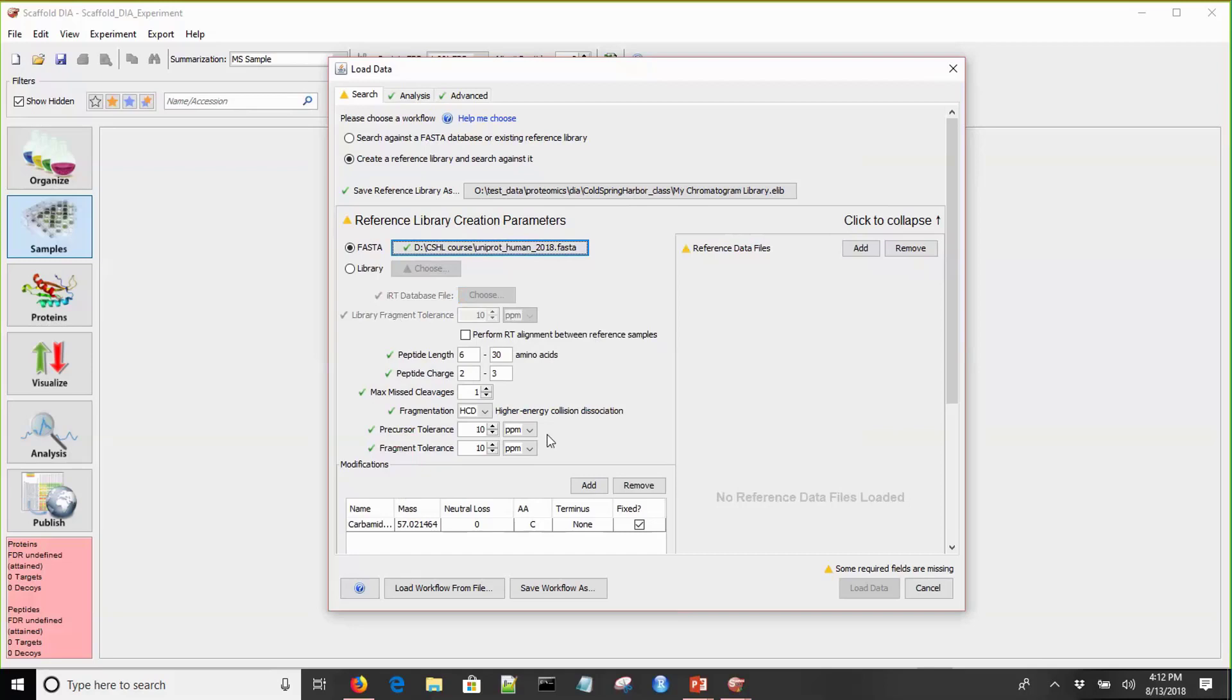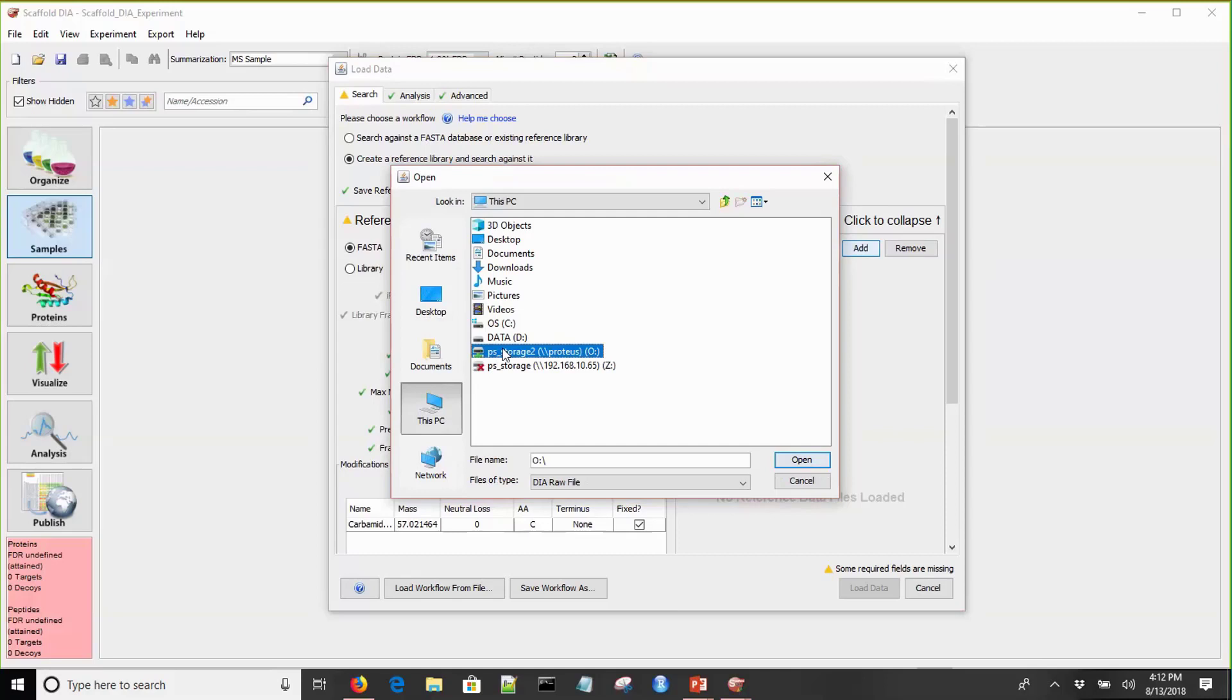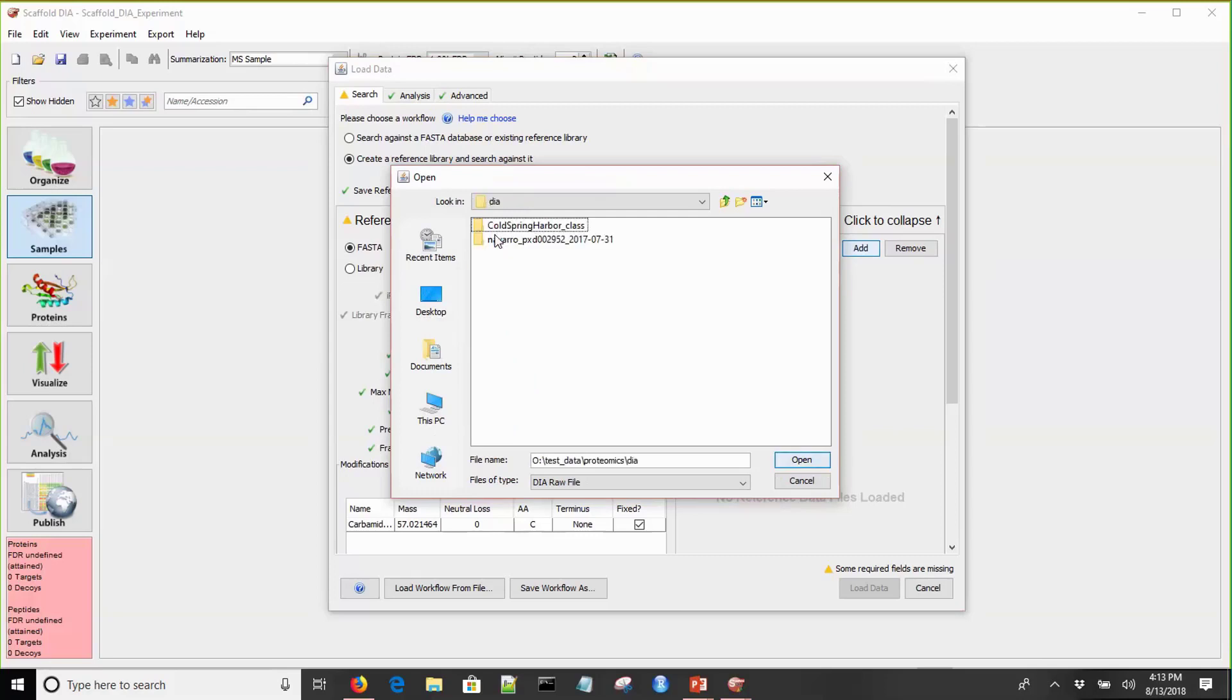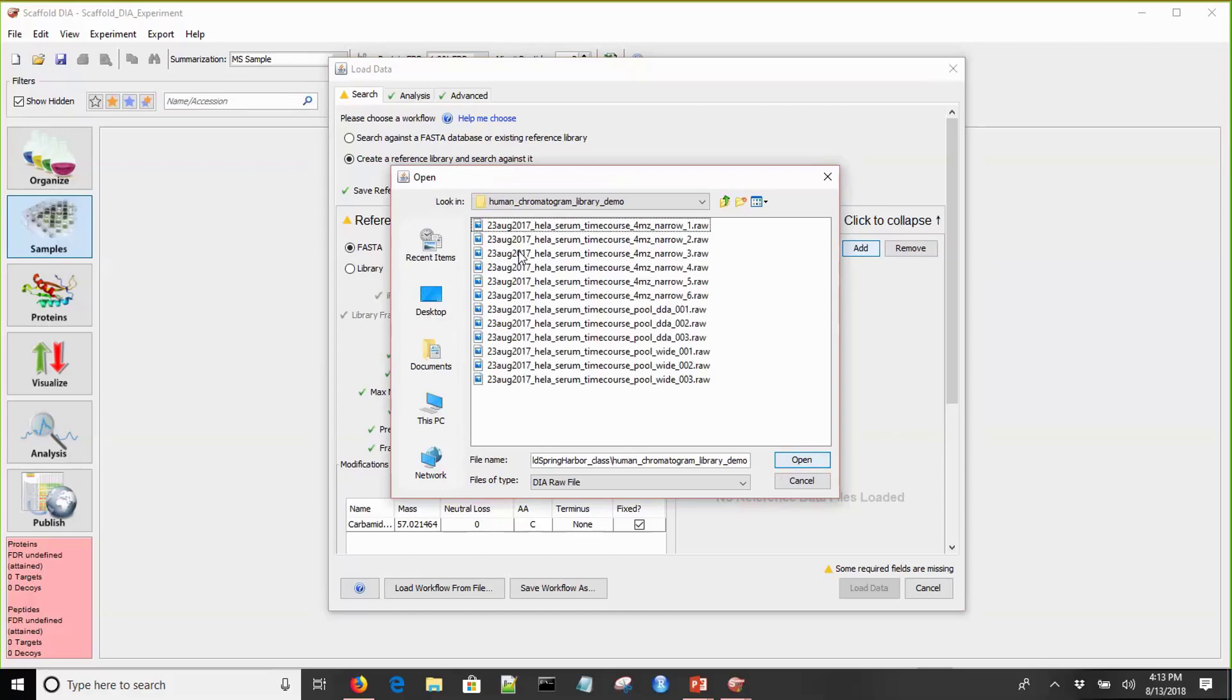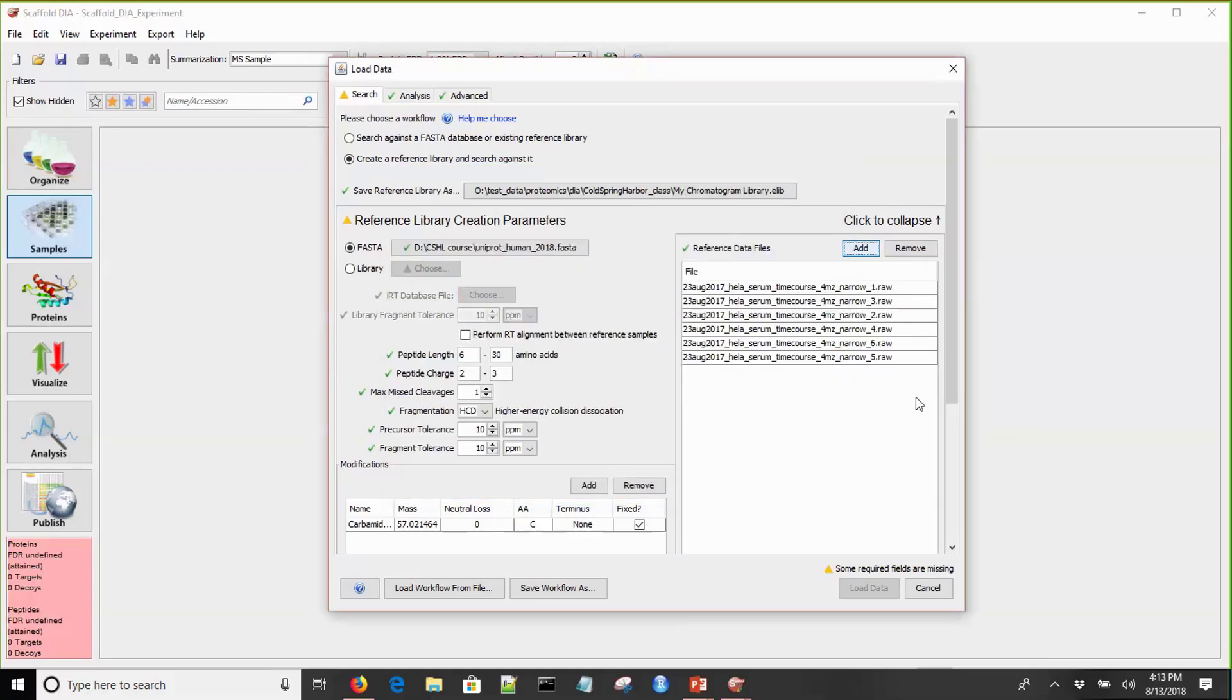You'll see down here there are parameters that are familiar to most people who've carried out DDA searches, such as peptide length, peptide charge, and precursor and fragment tolerance. We'll leave these set as default. Now let's pick our reference data files. Remember, these are only the ones that we're going to use for our reference data search. The experimental data files are loaded separately. I'm going to select all six as the M/Z ranges have been narrowed by gas-phase fractionation.